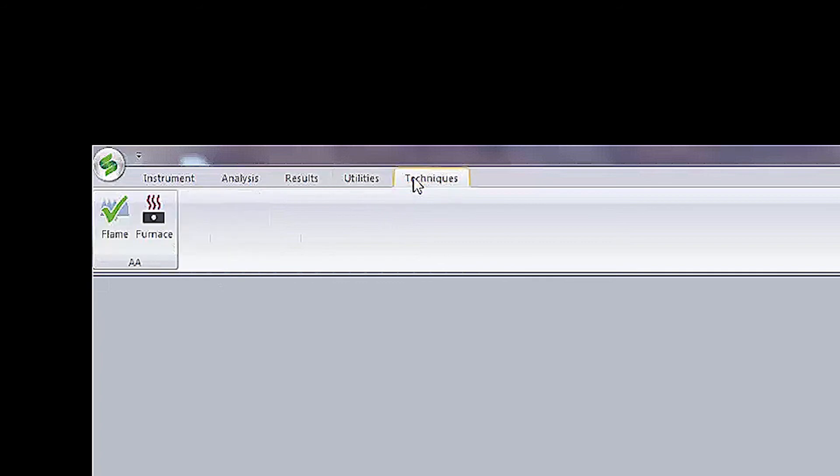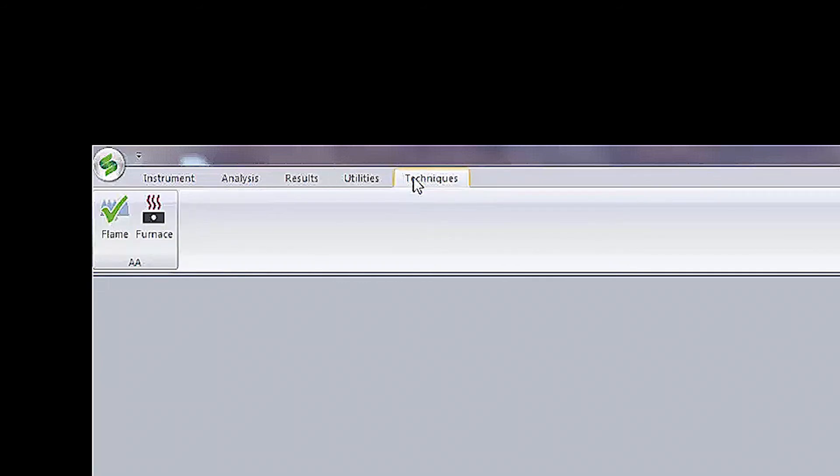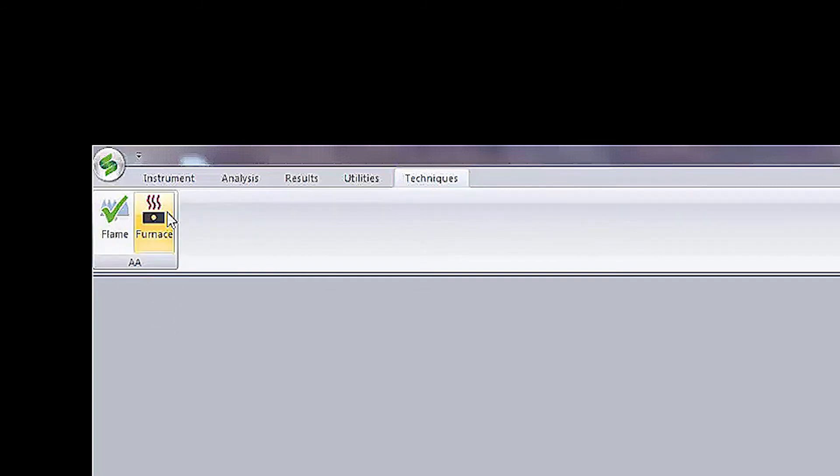The final tab is Techniques. Here you can choose the type of technique you are running, flame or furnace technique, depending on your instrument configuration.